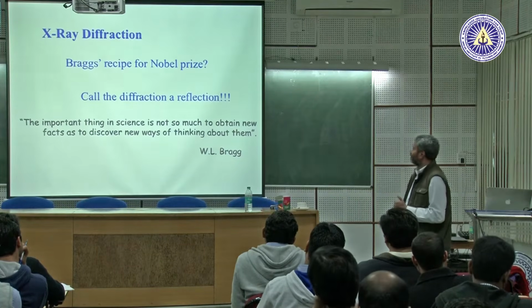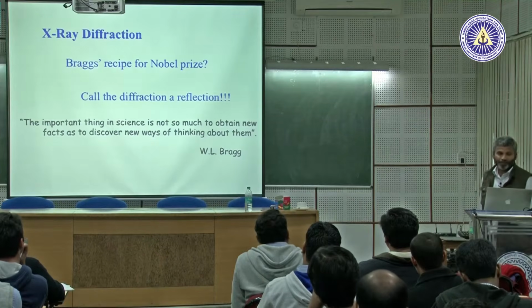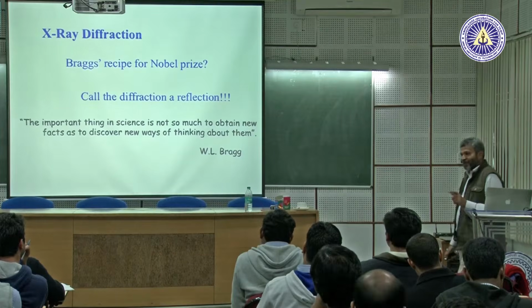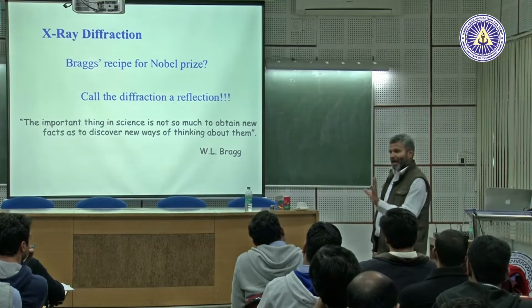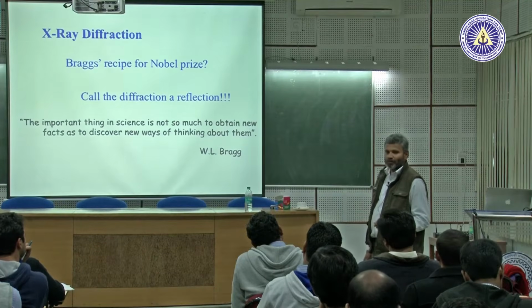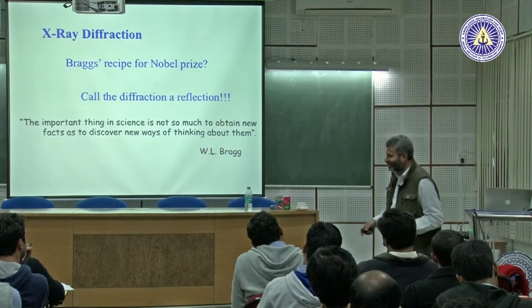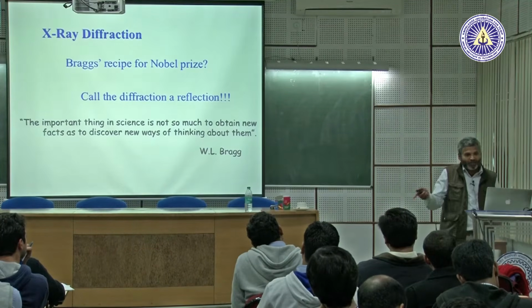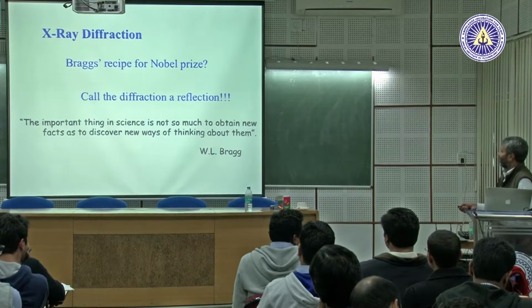So, X-ray diffraction as a tool for crystal structure solution was established by Bragg, and that is his credit. In fact, Laue, in the very first paper on diffraction, in the analysis of the diffraction pattern, mixed up and got the crystal structure wrong. He could not solve it because of his complicated way of looking at it. He got it wrong. Later on, of course, it was corrected.